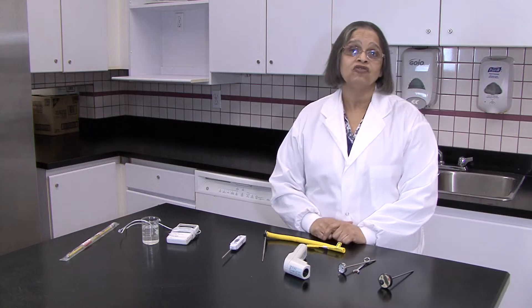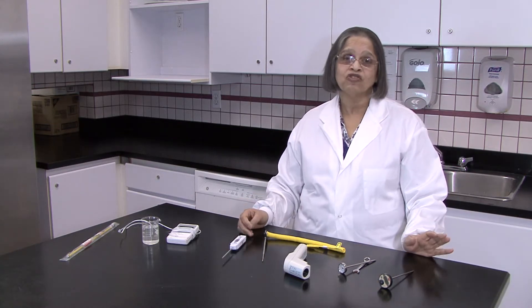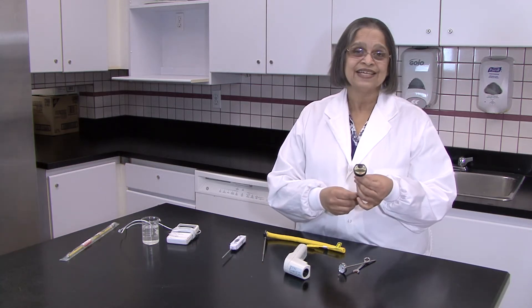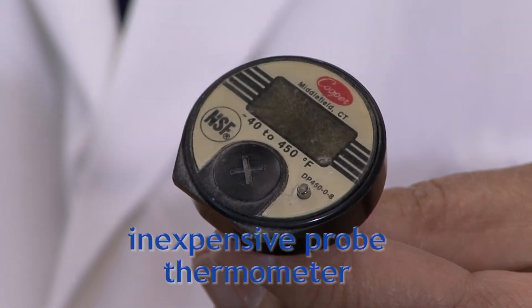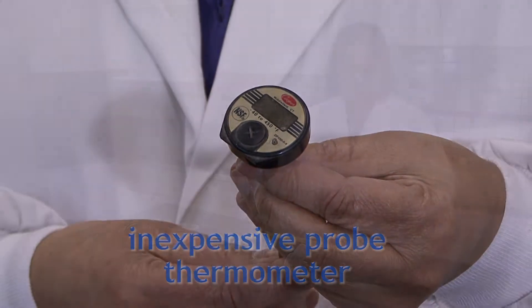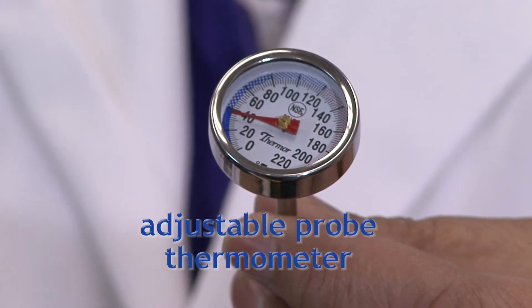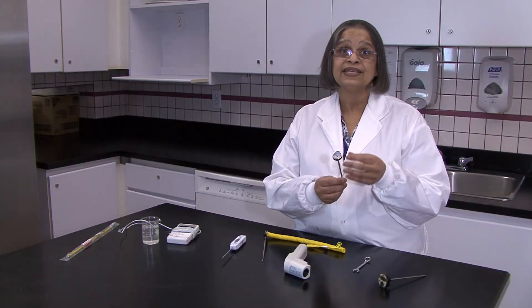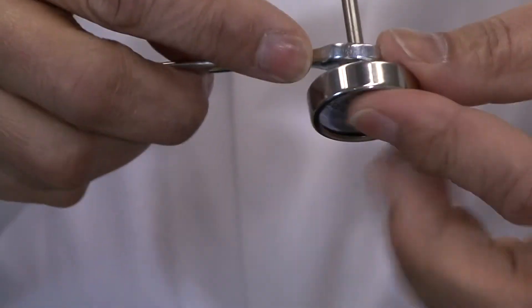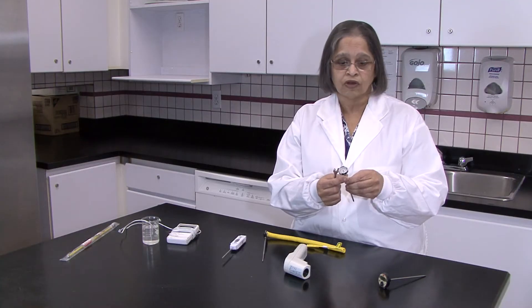Different applications require the use of different thermometers. I have here a wide array of thermometers that can be used for different applications. The first one is an inexpensive thermometer that cannot be easily calibrated, so it is not suitable for use in the food industry. This next one is a little more expensive — it is also a dial thermometer, but its advantage is that it can be calibrated. You can take a little wrench and turn the nut at the bottom to adjust the calibration so that it reads correctly.